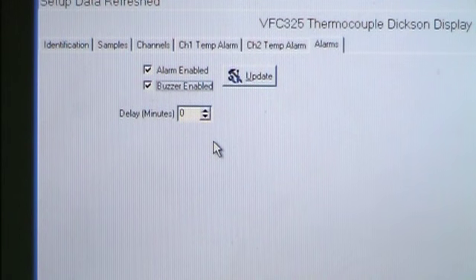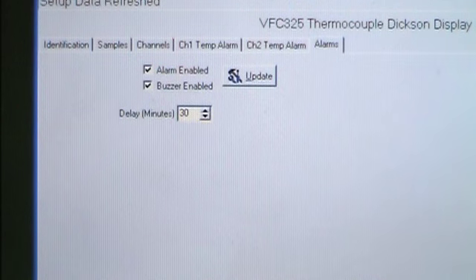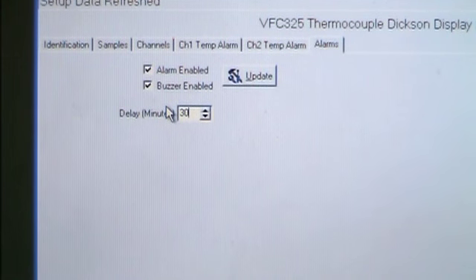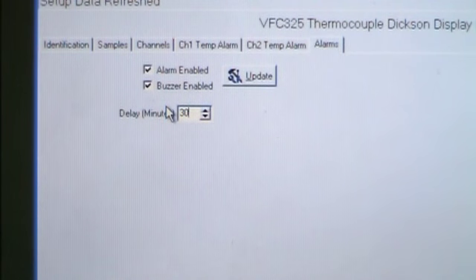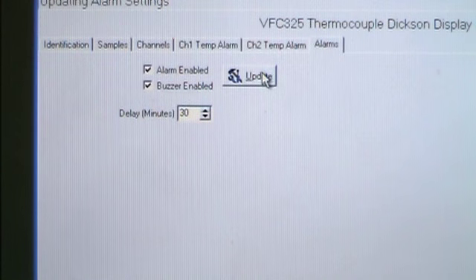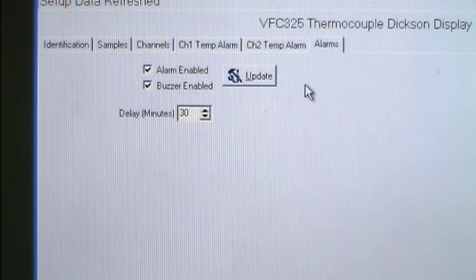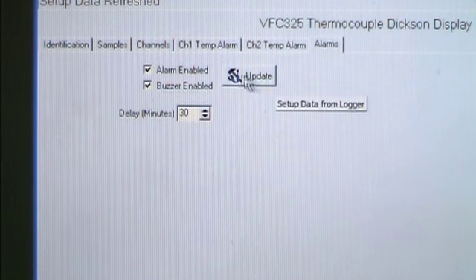In the Delay field, type in the number of minutes that you want to delay an alarm notification. For example, setting a 30-minute delay means that if the unit senses an out-of-range temperature, no alarm will sound or display. Holding the alarm button down for 5 seconds will reset the alarm for the duration of the delay period. If the out-of-range temperature still exists at the end of the delay period, the alarm will sound again. Click Update to save all of your changes. To disable one or both alarms, click the check mark to remove it and choose Update.